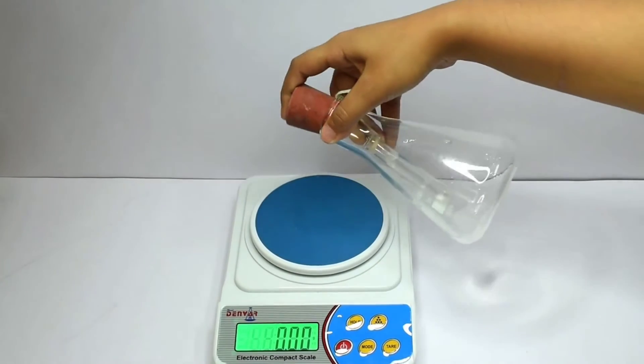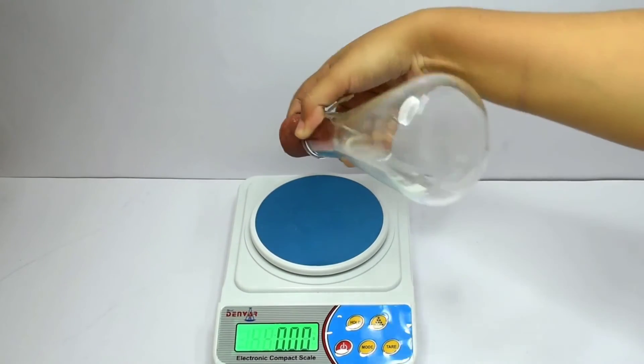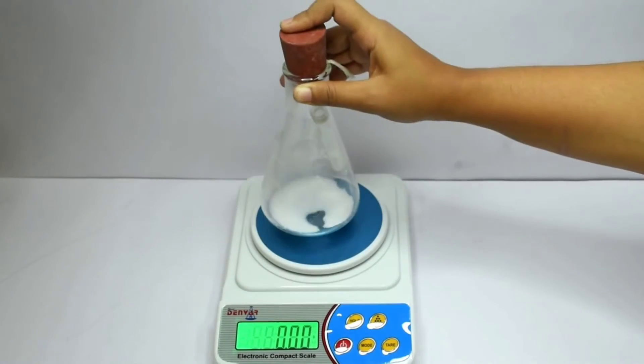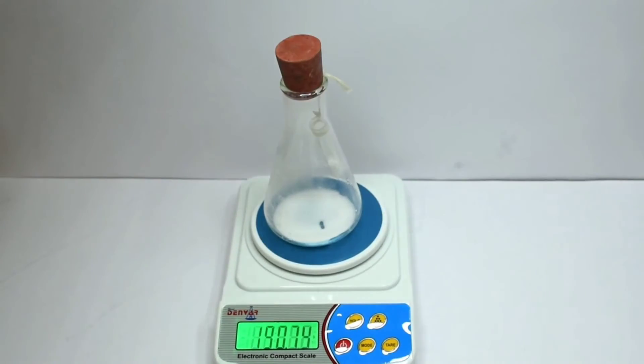Gently tilting and swirling the flask, we will allow the two solutions to mix and weigh again. If you observe carefully, the weight after the reaction is equal to the weight before the reaction.